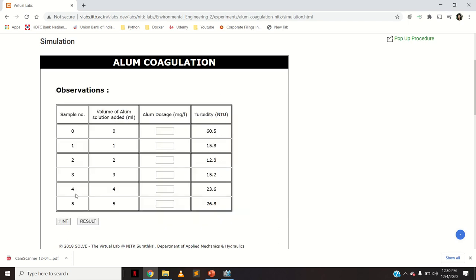The sample numbers are 0, 1, 2, 3, 4, 5, corresponding to the volume of alum solution added. The alum dosage must be converted: 1 ml of alum solution equals 10 mg/L, 2 ml equals 20 mg/L, 3 ml equals 30 mg/L, 4 ml equals 40 mg/L, and 5 ml equals 50 mg/L. Since dosage is expressed in mg/L, this conversion is necessary.